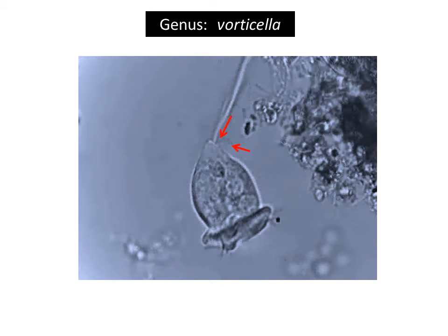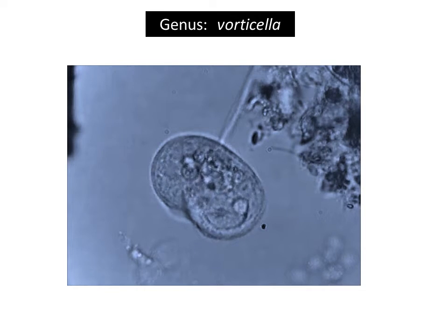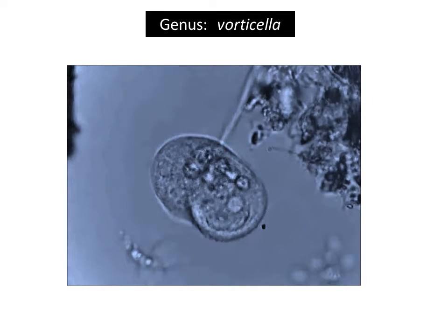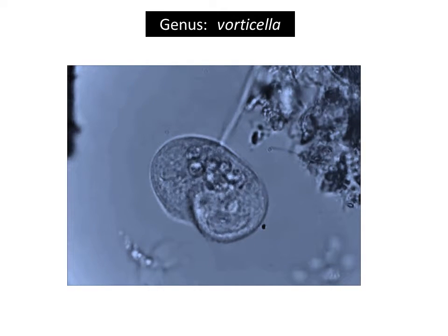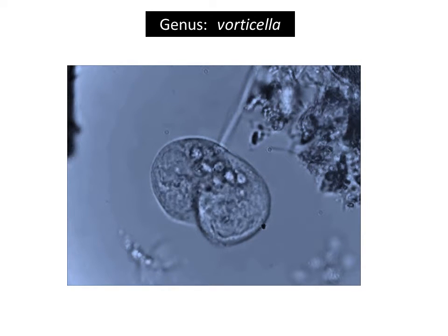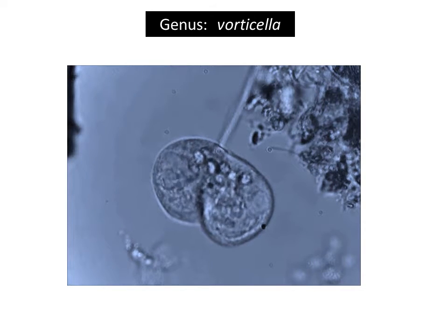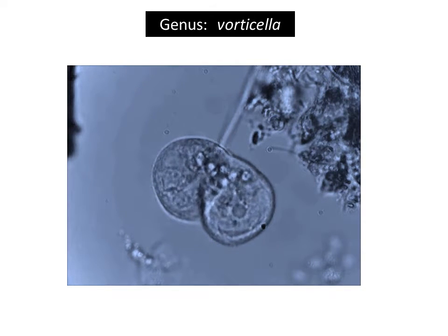Note the small piece of what appears to be torn cytoplasm at the site at which the telotroch had been attached. Here is the video in its entirety, sped up 8-fold and approximately 2½ minutes in length. The original video runs somewhat over 20 minutes.